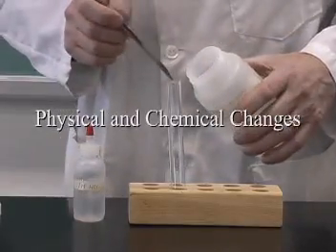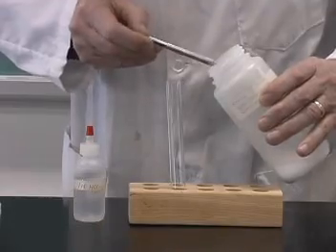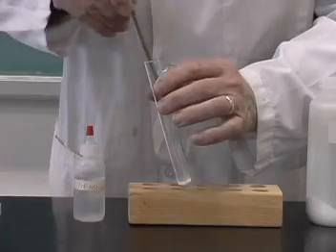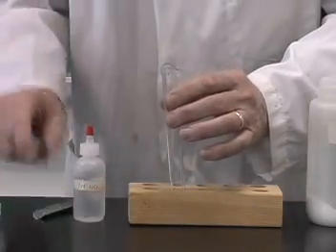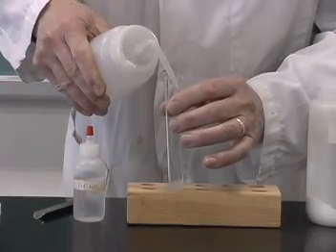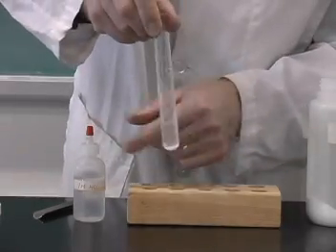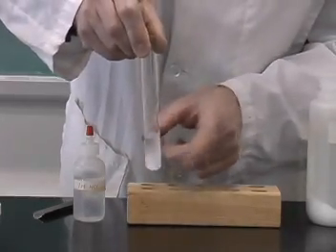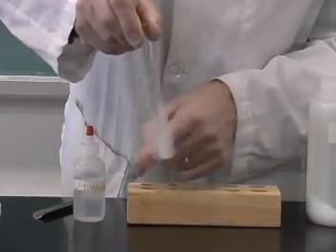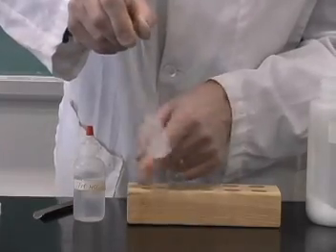We'll consider some physical and chemical changes. I'm going to begin by taking a small amount of sodium bicarbonate, baking soda, and adding water to that in the test tube, and then mixing the two. One way to mix it is just to hold the test tube by the neck and then swirl the liquid by hitting the bottom of the test tube.